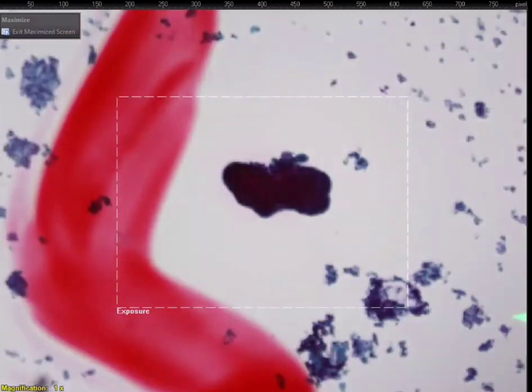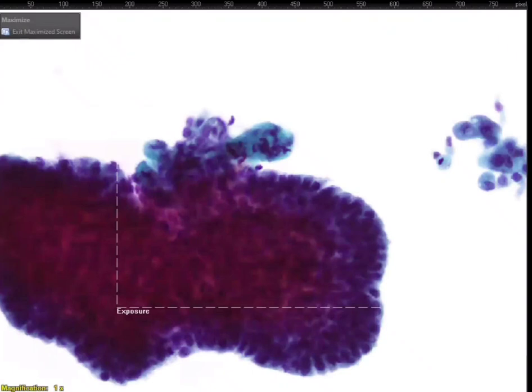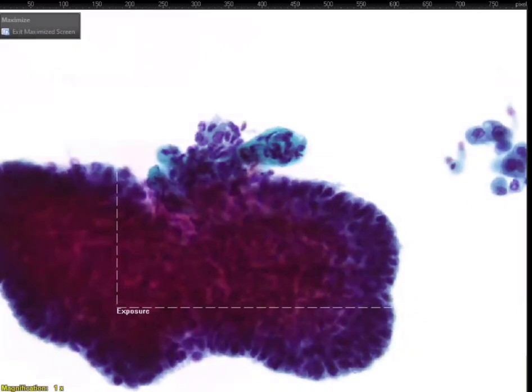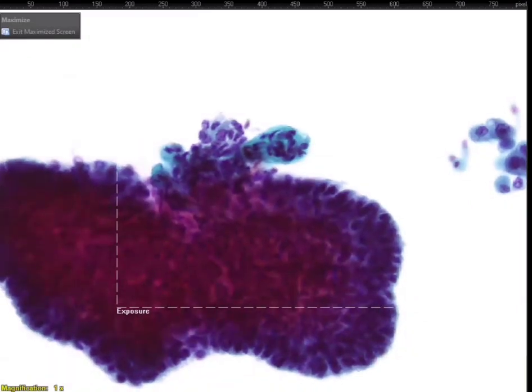That's a benign condition, and you can see normal lymph node tissue in the middle of the thyroid. Is that what you're saying? Yes, and vice versa, right, exactly.